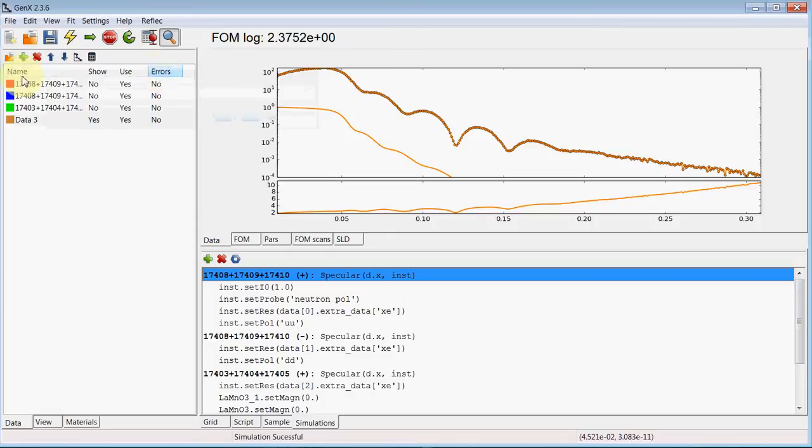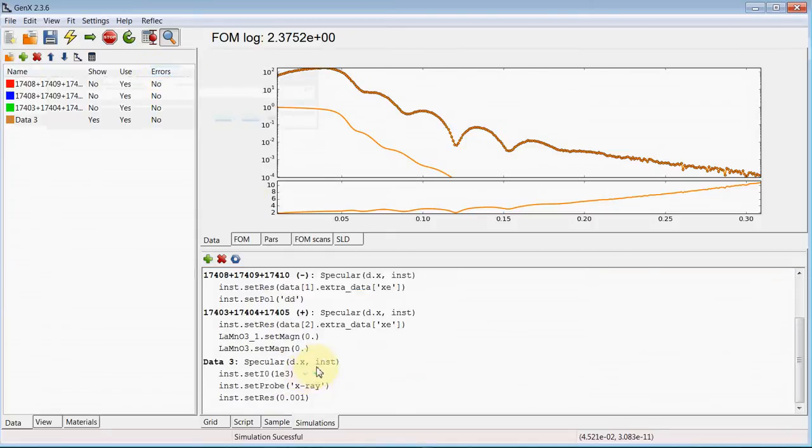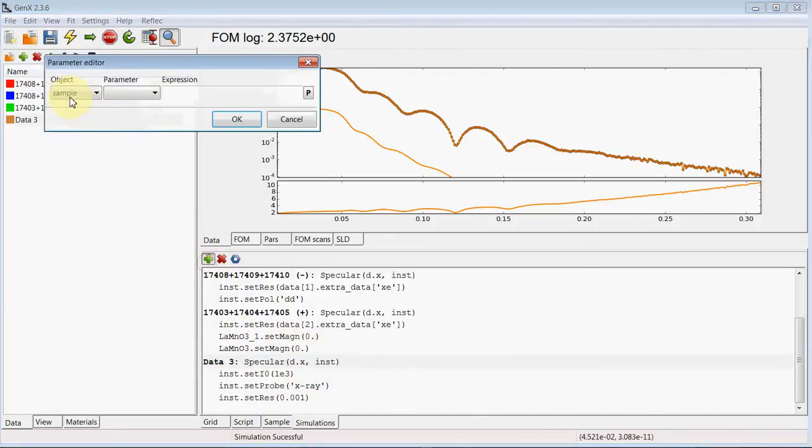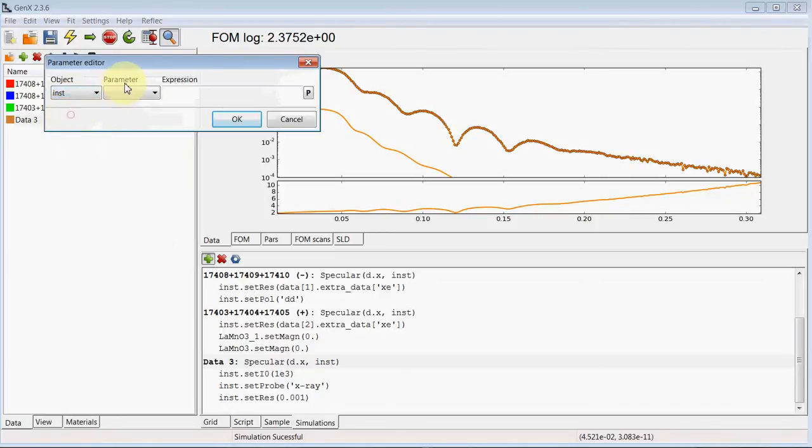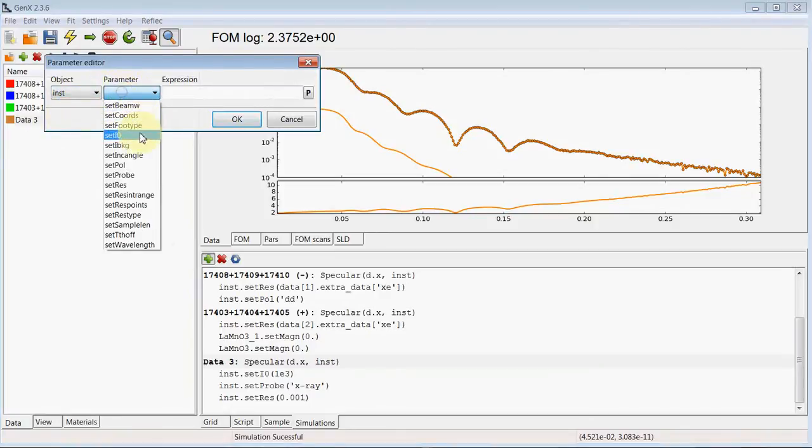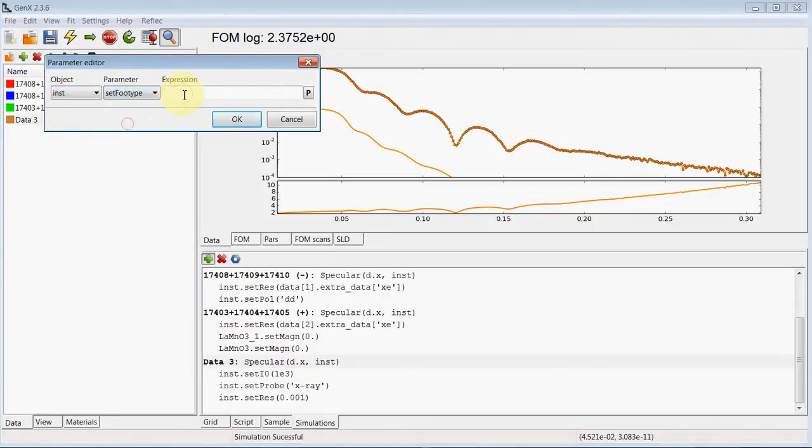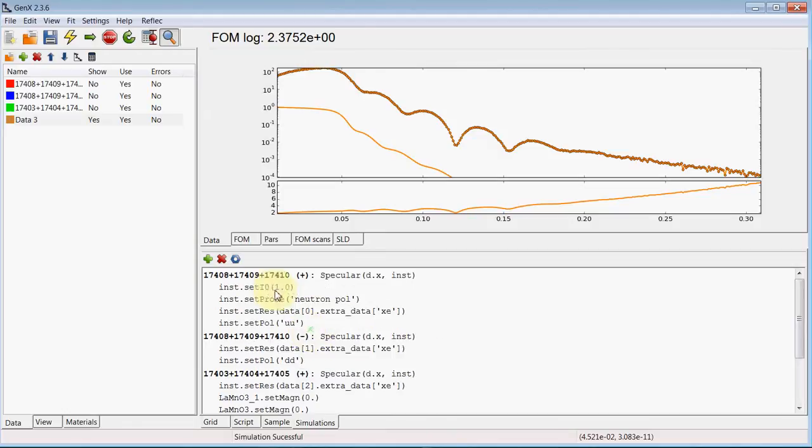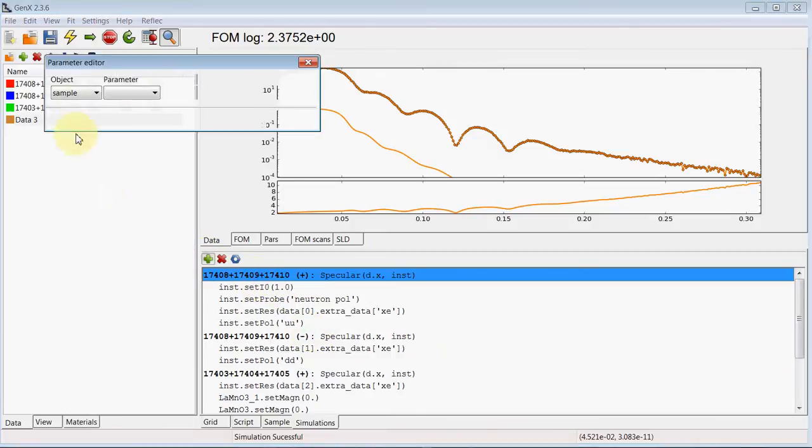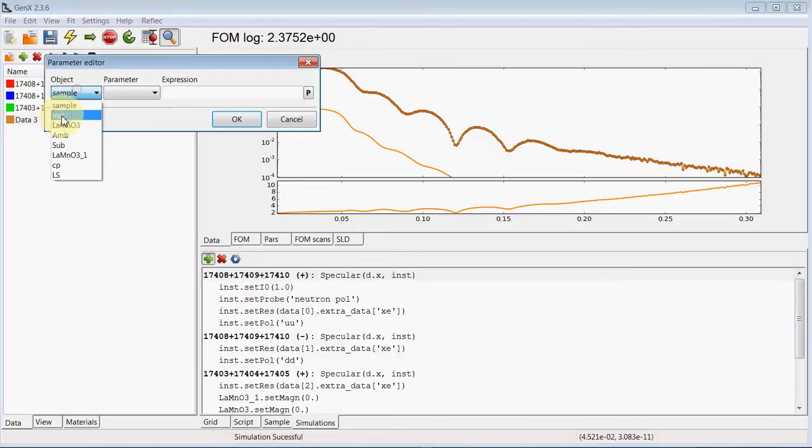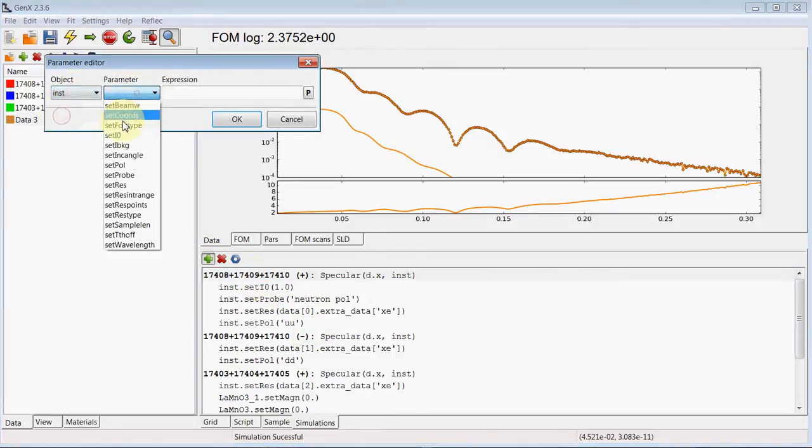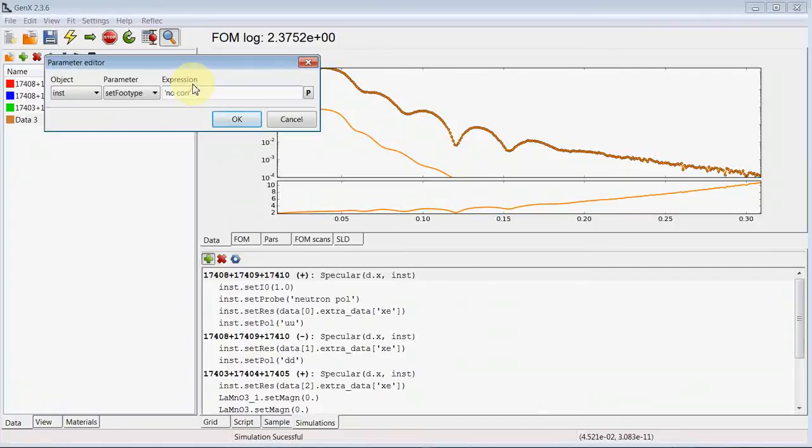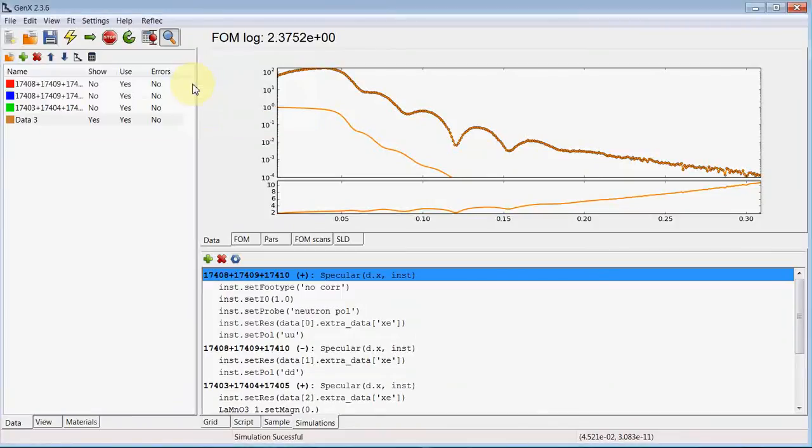To add the footprint correction, use instrument set footprint type. Here we use square beam, and this we want to reset also at the beginning with instrument set footprint type no correction.